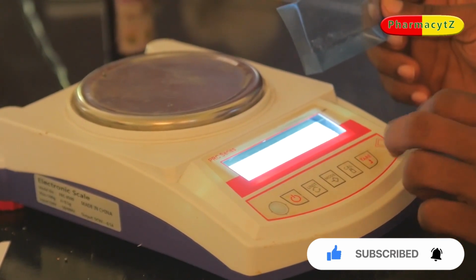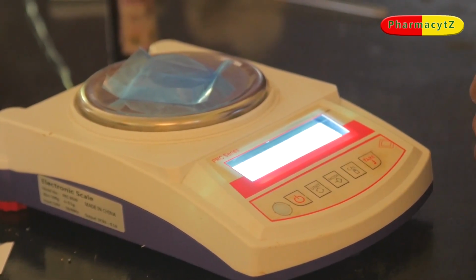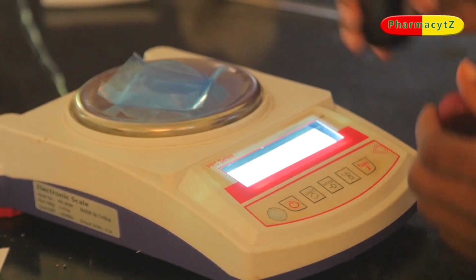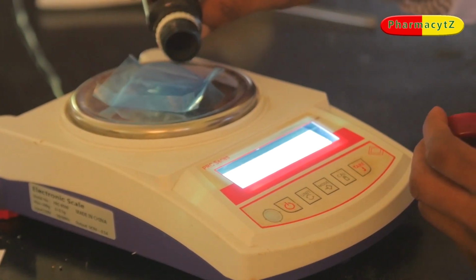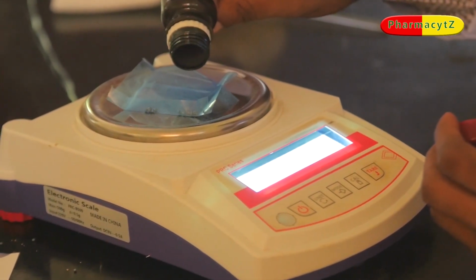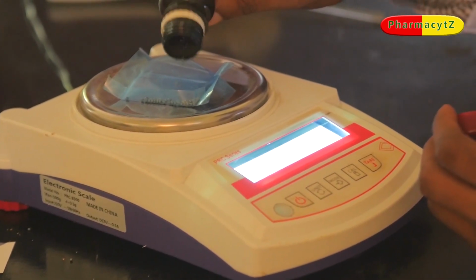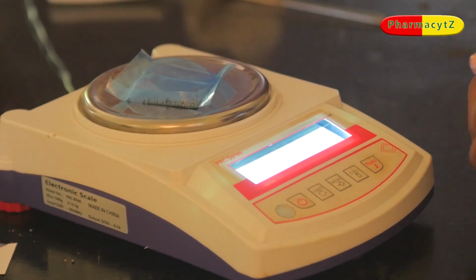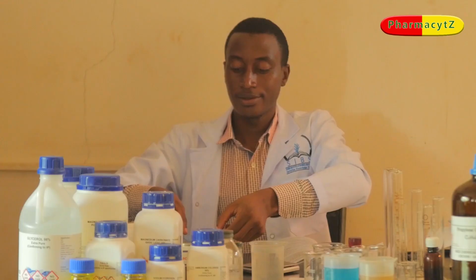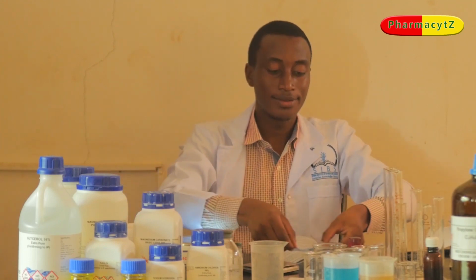You press the tare menu, then you put your X-ray film, then tare to 0, so as to neglect the weight of this X-ray film. Thereafter, you weigh exactly 1 gram of iodine. This is exactly 1.0 grams of iodine crystals, which we are going to use in our preparation. Thereafter, I'm going to weigh potassium iodide.